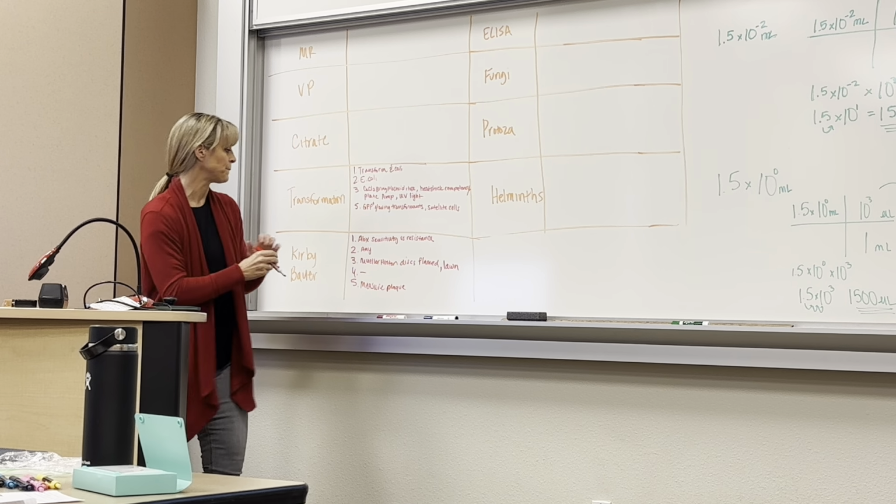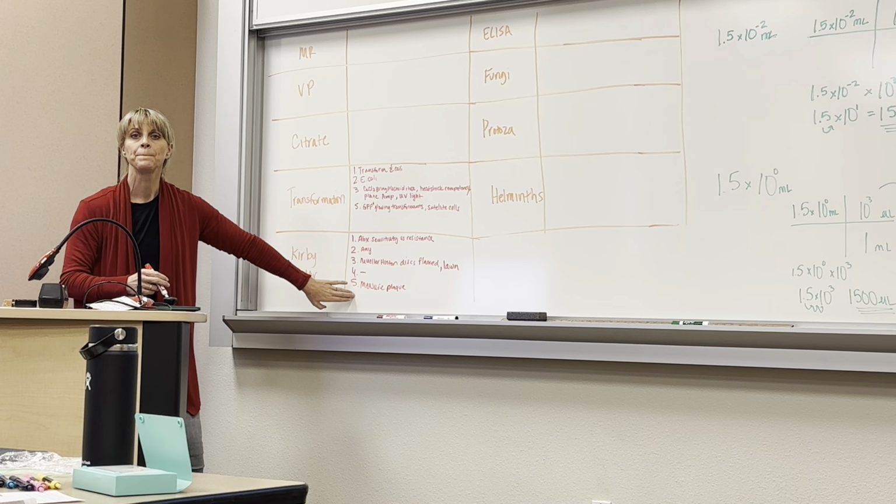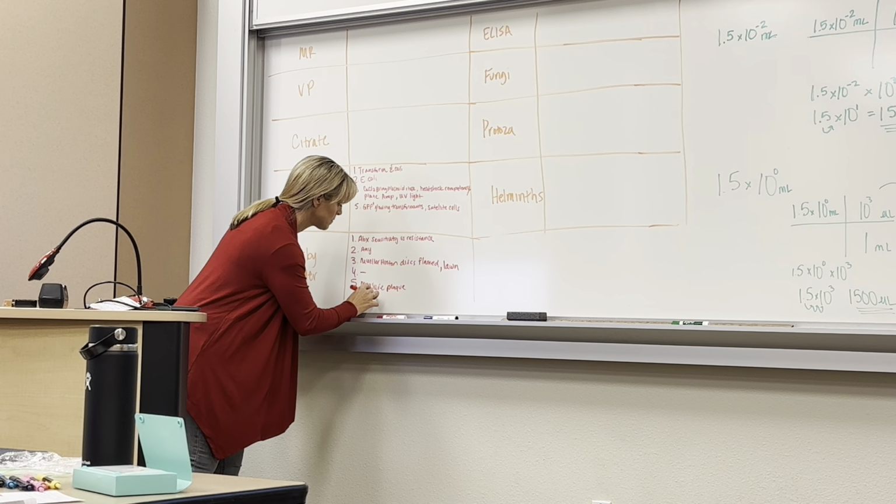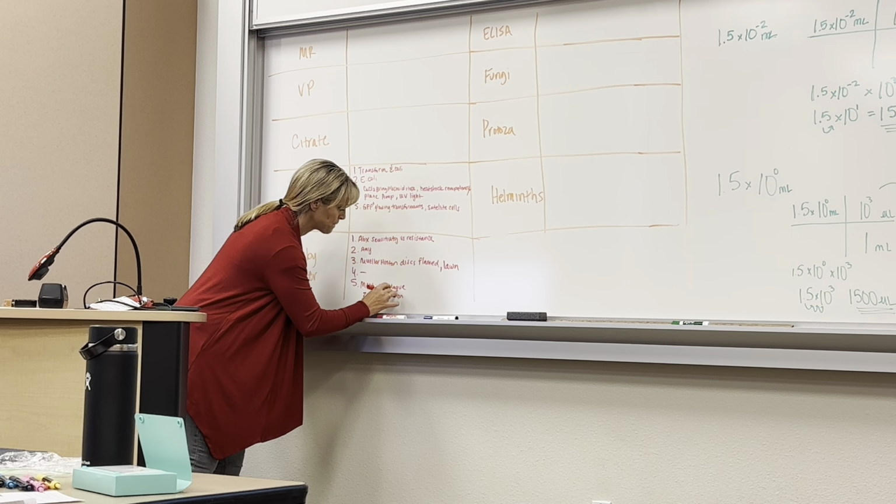Okay, let's move on. I just found it. It's the zone of inhibition. Zone of inhibition, awesome. Cool.